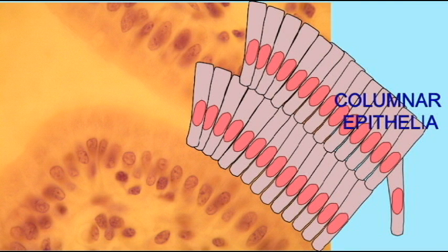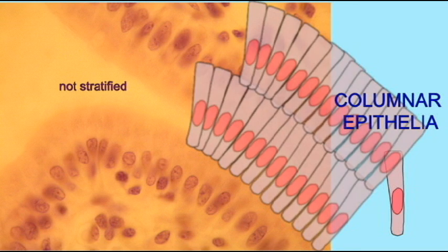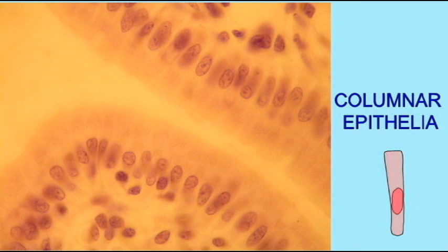So these are columnar cells. This is a simple epithelium rather than a stratified epithelium. If it were stratified, there would be multiple layers of cells, and clearly that is not the case. So this is an example of simple columnar epithelia.